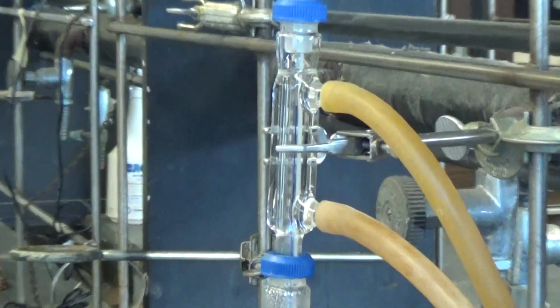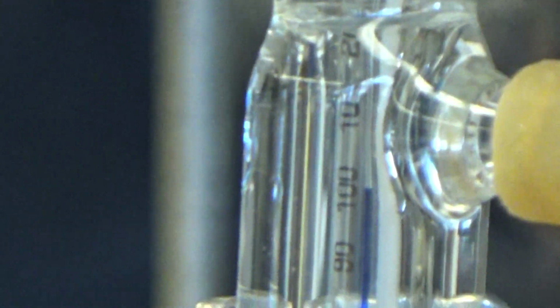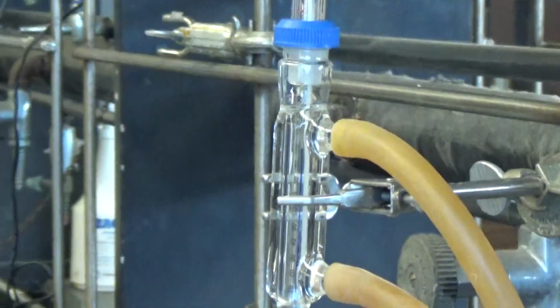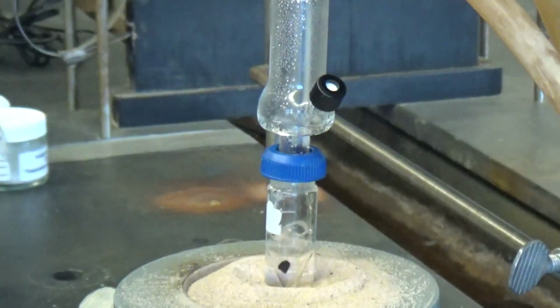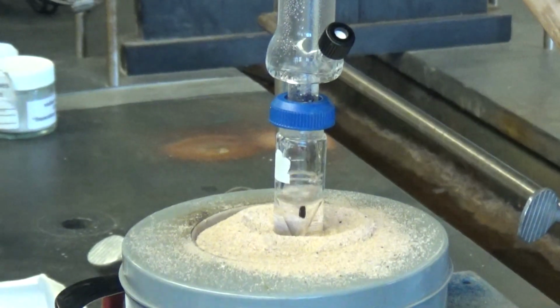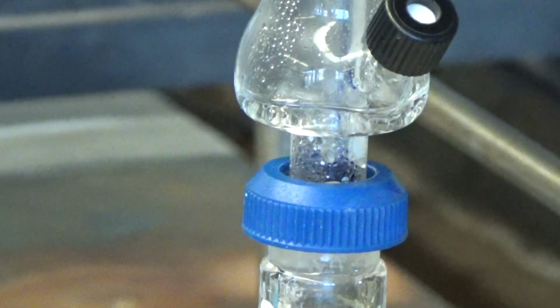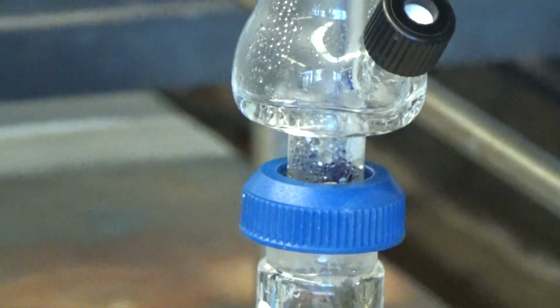Let's check the temperature again. It's actually wiggling around 100. It goes up and down and up and down. That's pretty cool. I think now we can stop it? Because I think we have enough there. Let's wait 1 more minute, and then we stop it. Get all that product up there.